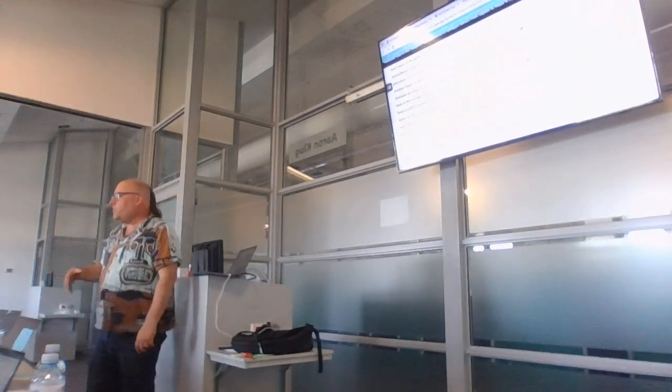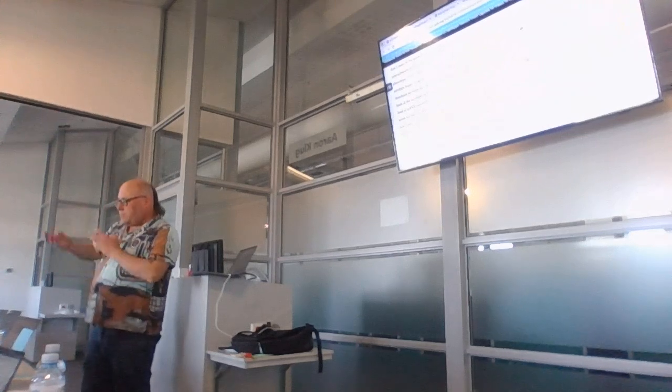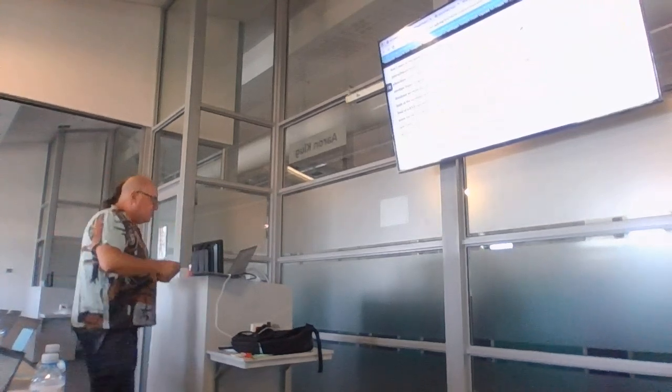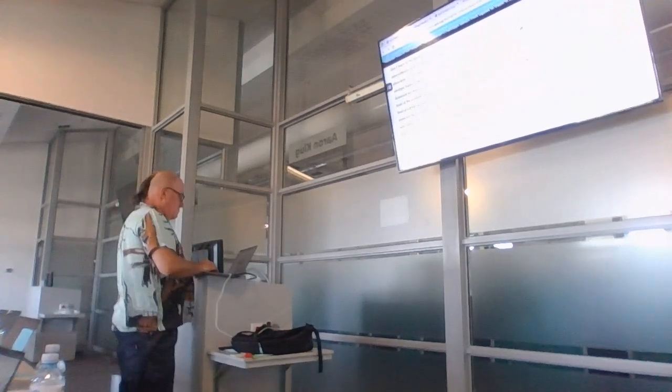So this is the problem that we have. Data is not laid out on a plate for you sometimes. You have to go hunt for it.